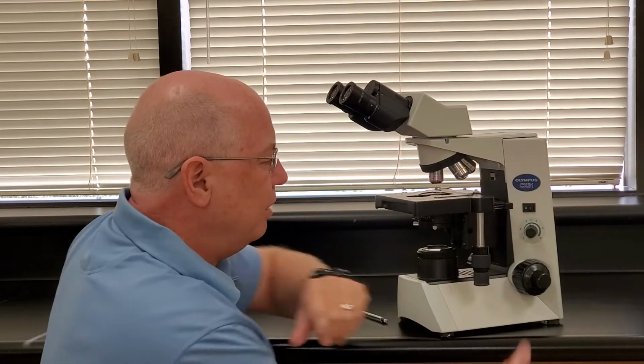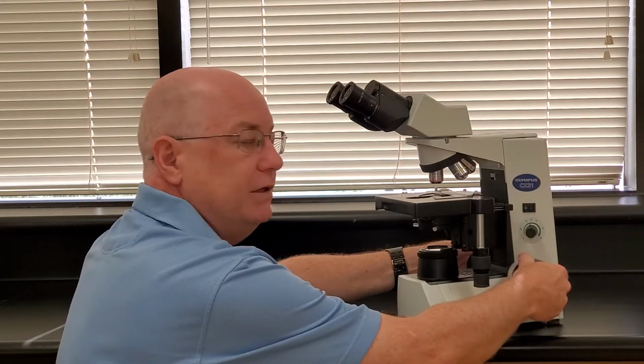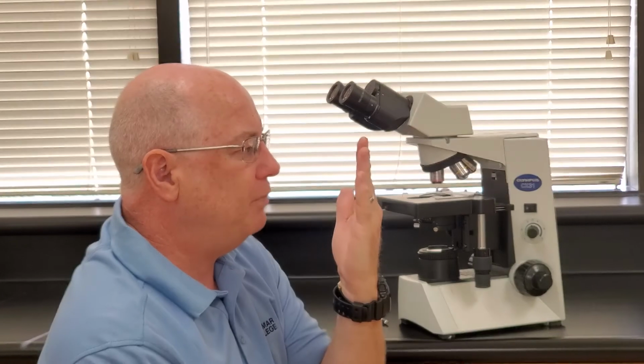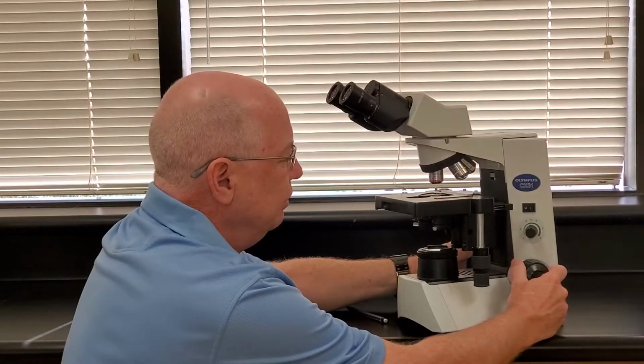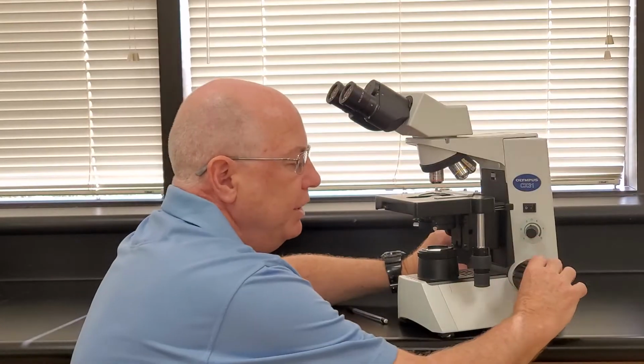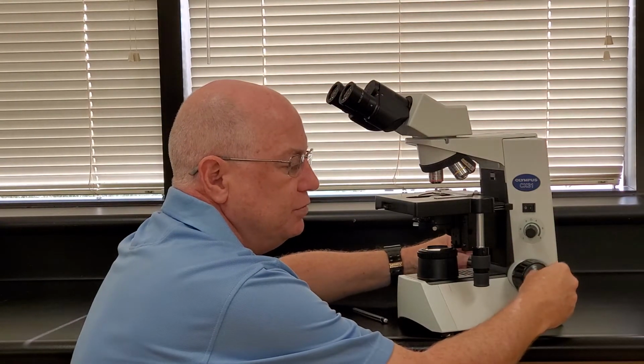And I start backing off using the coarse focusing knob until I see it. You don't just stop when you see it, you go until it gets really sharp, and then it gets blurry again, and then you go back and forth and get it as good as you can get it with that knob. Then you make very fine adjustments with the fine focusing knob.